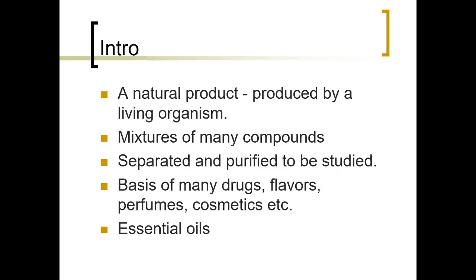So what is this lab about? As you've done in a previous lab where you extracted nutmeg, you're also doing a natural product extraction. This is very important for organic and medicinal chemistry because a lot of things that we use as pharmaceuticals have some basis in natural products. When we say natural product chemistry, we mean that these materials are derived from living organisms.